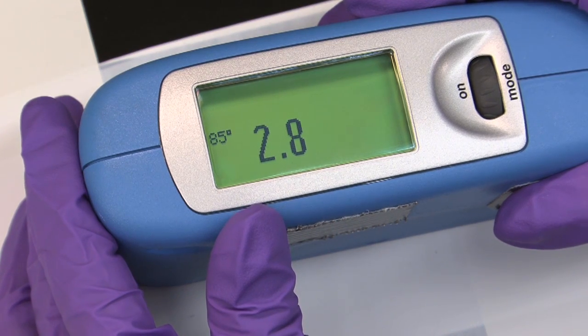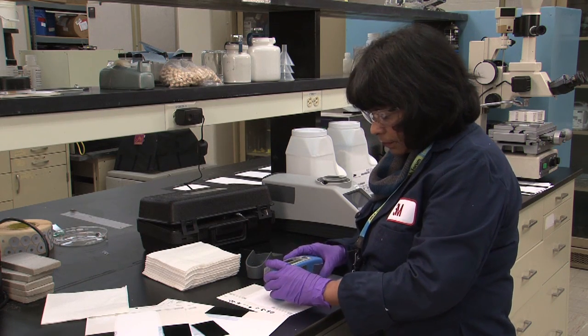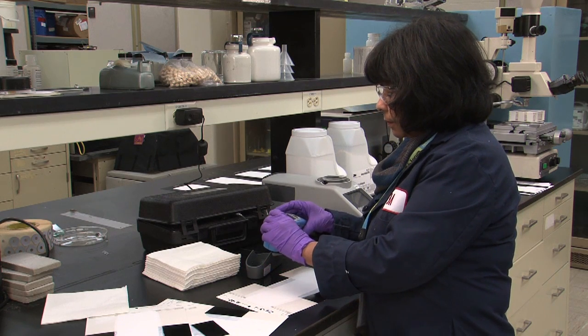We then calculate the percentage at which the gloss of the painted surface has increased. The higher the percentage, the more burnished the surface.